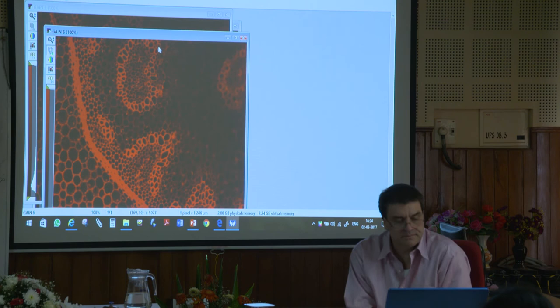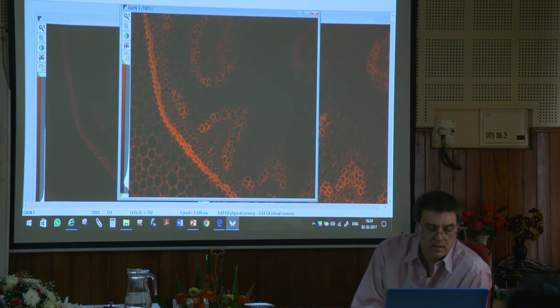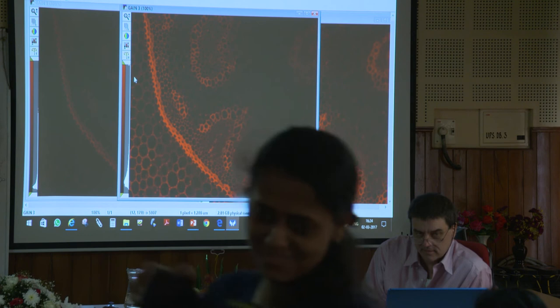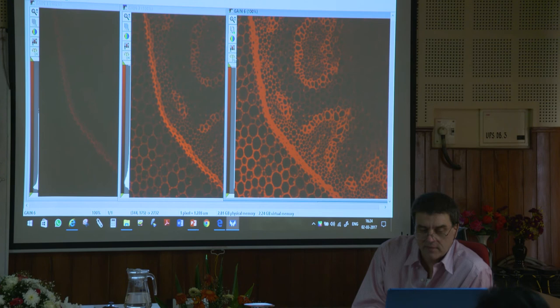Okay, just something else on a camera that you can control, and it's called gain. Now if I want to compare these fairly, what do I have to do? These three images, what do I have to do? Remember, I got to set my scaling the same, right?